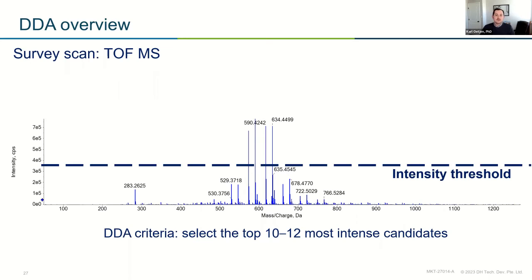And if we think about the question we're again asking, are these compounds present? We couldn't possibly set up an experiment with, let's say we're searching a library of 1,000 different drugs, 1,000 different MRM HR experiments. It would just be too many. They'd be running all the time since we didn't know when the retention time was. So instead, this is our way to create a comprehensive MSMS approach that doesn't rely on things like retention time.